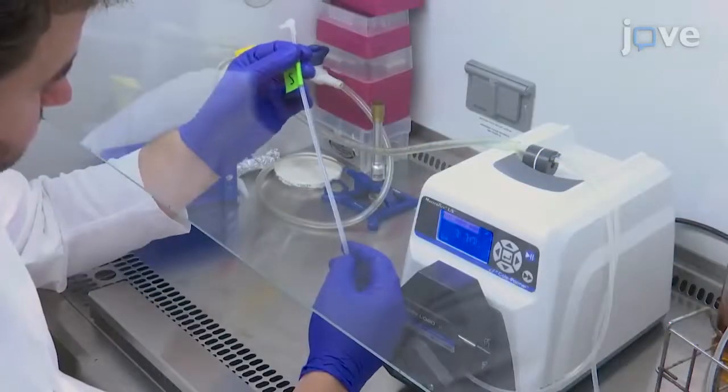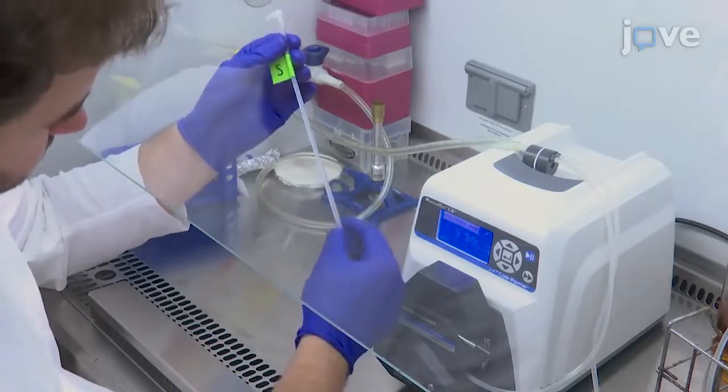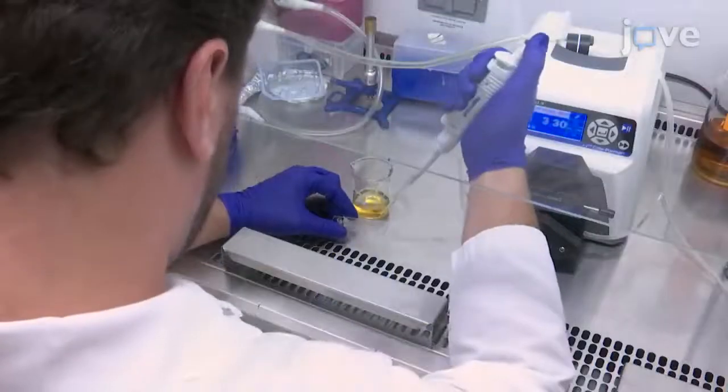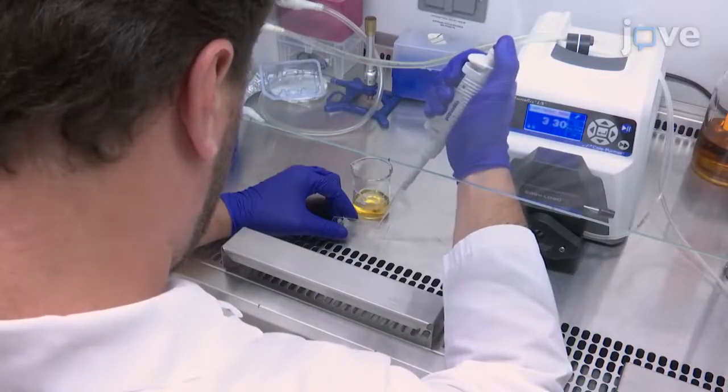Ensure that the green side of the tubing is filled with media and has no bubbles downstream of the bubble trap before proceeding. Fill the channel slide and the reservoir with YPD, taking care not to introduce bubbles. Connect the slide to the flow apparatus.